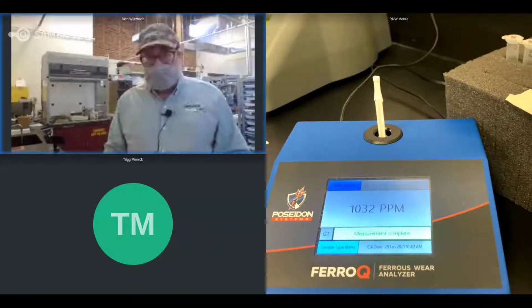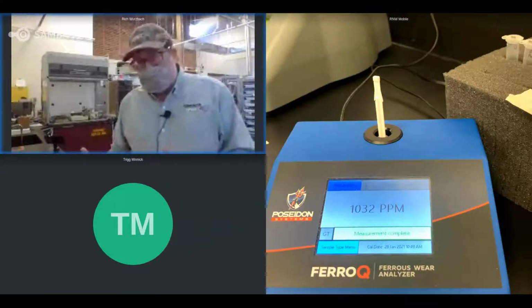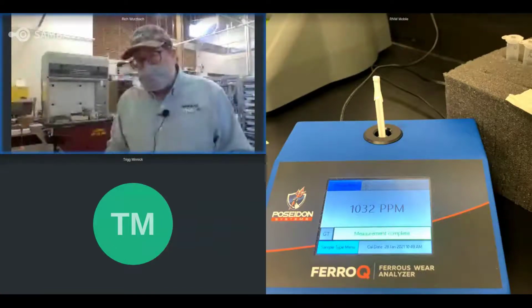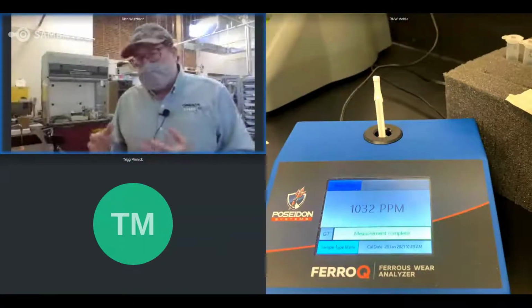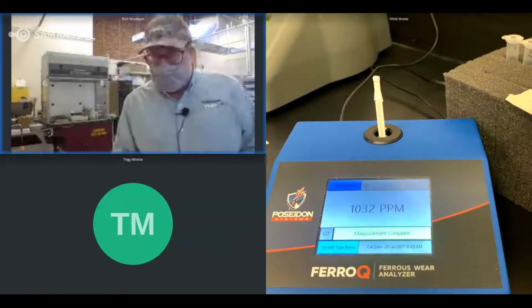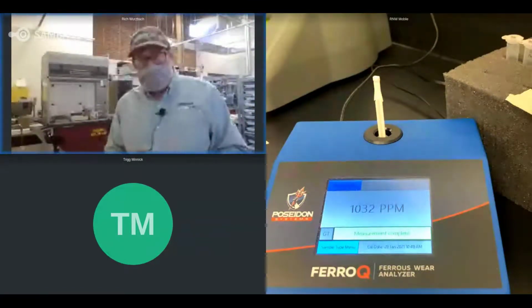If you're used to doing oil analysis, you'll have elemental analysis, typically inductively coupled plasma (ICP) analysis, maybe RDE, maybe even XRF analysis. And you'll have iron, lead, tin, copper, different kinds of metals, additives, and also some contaminant type things. But in there, you're going to see that iron, or it might say Fe, and that's elemental iron.